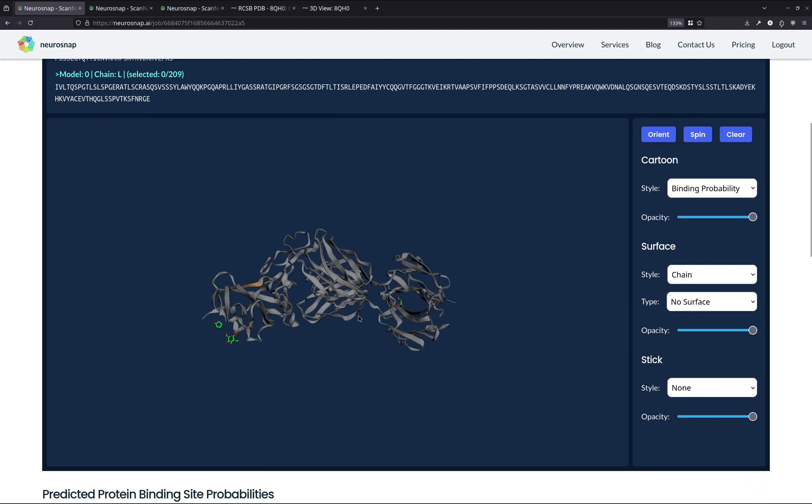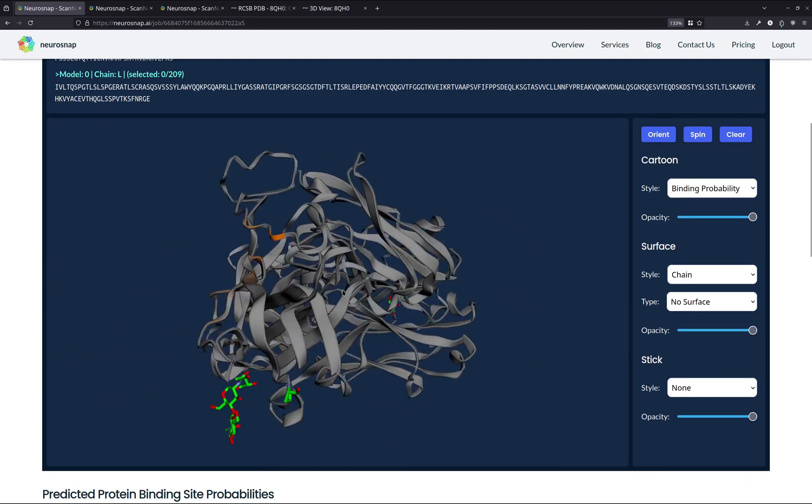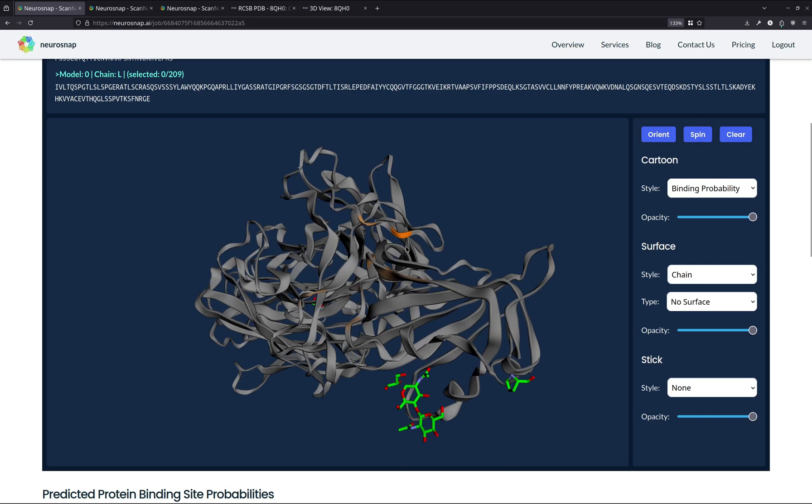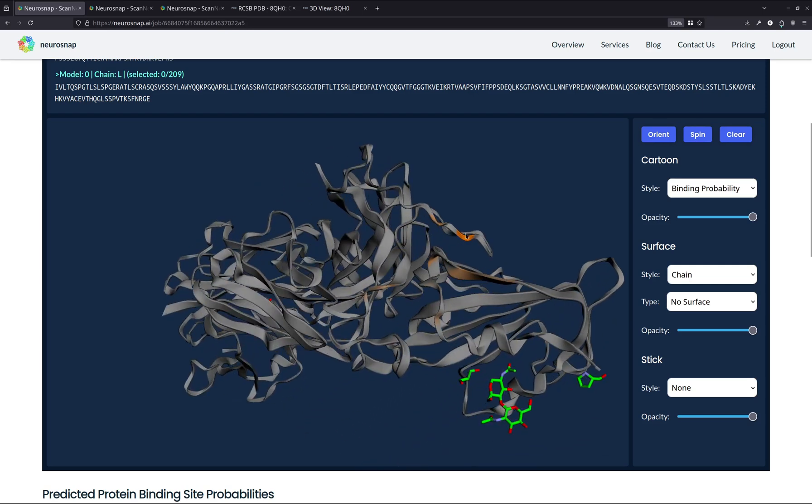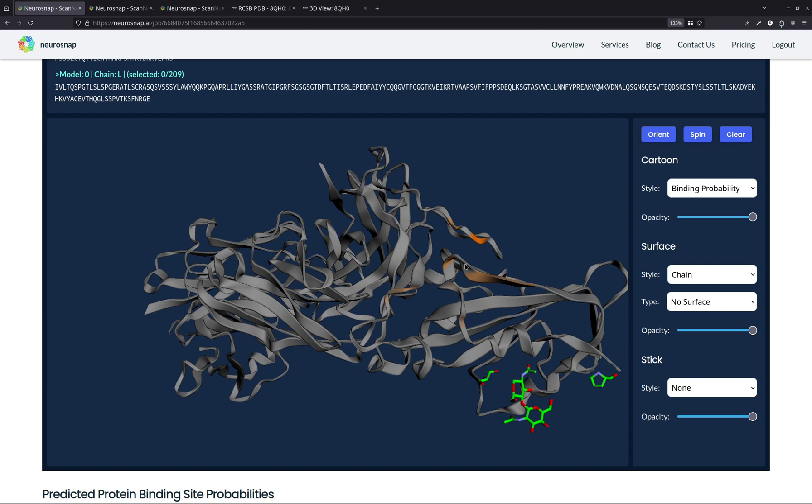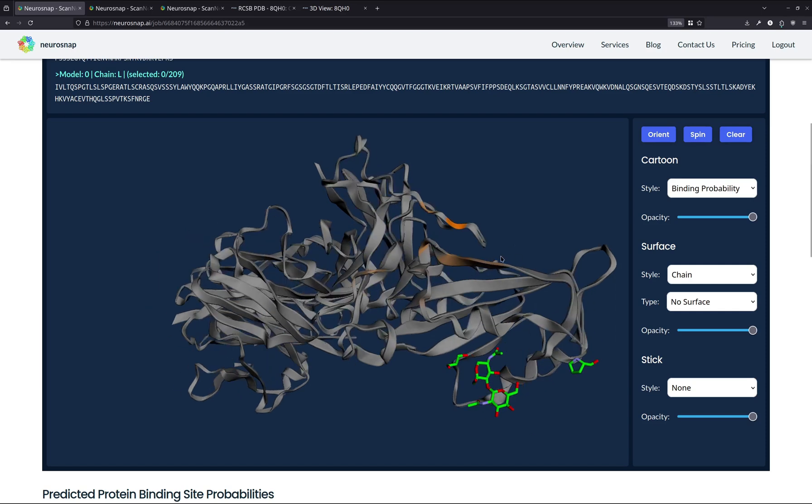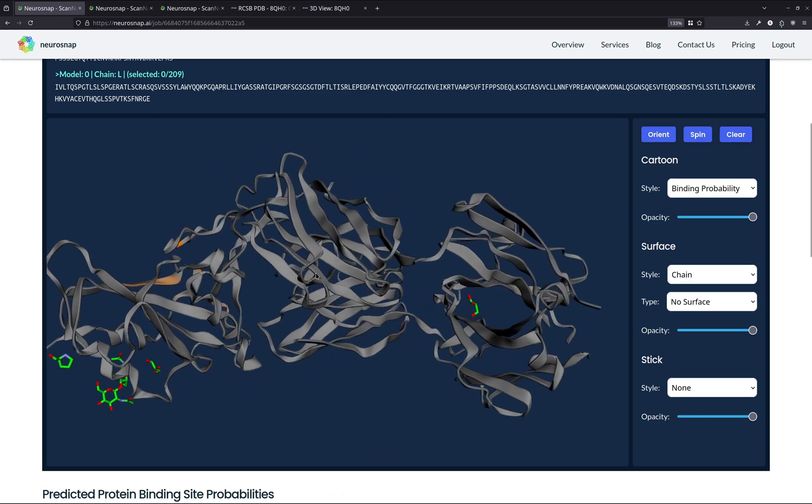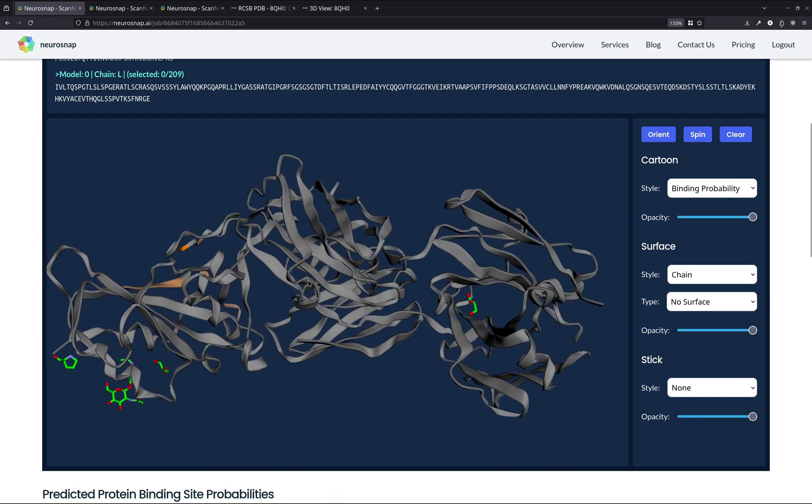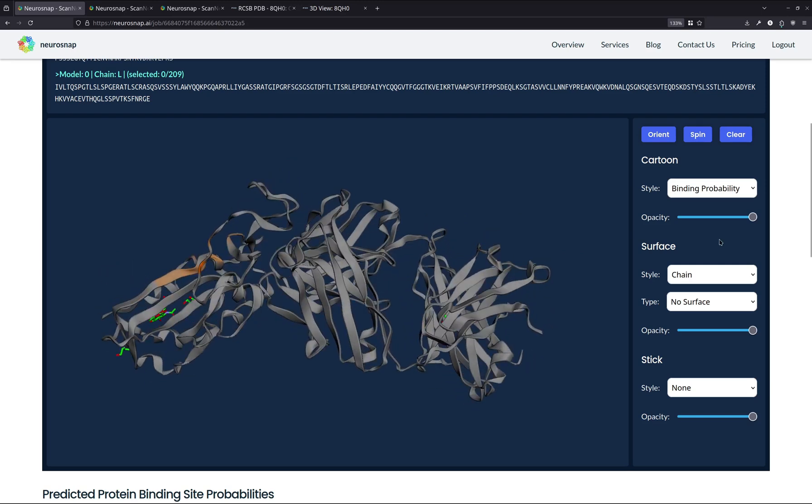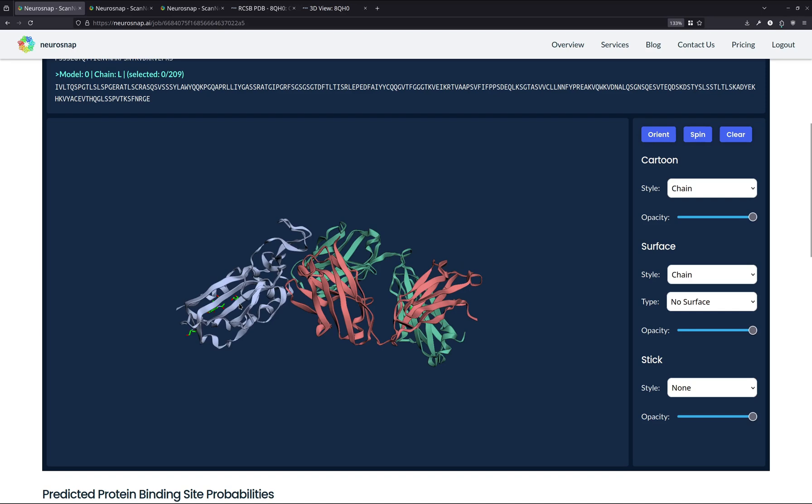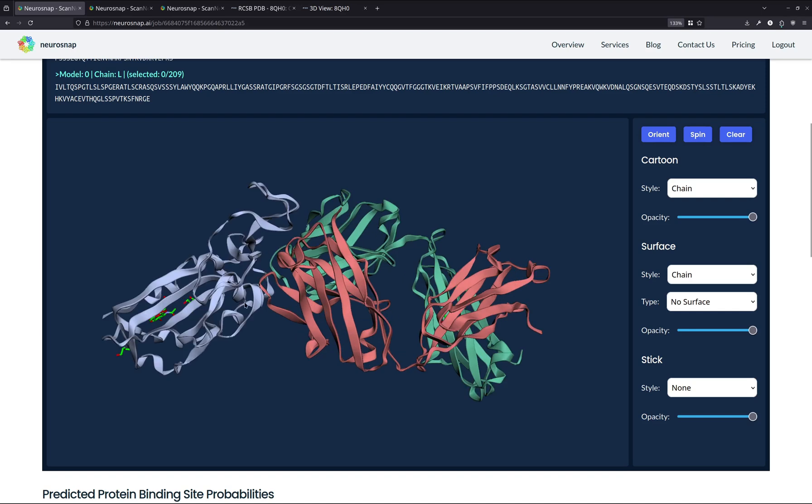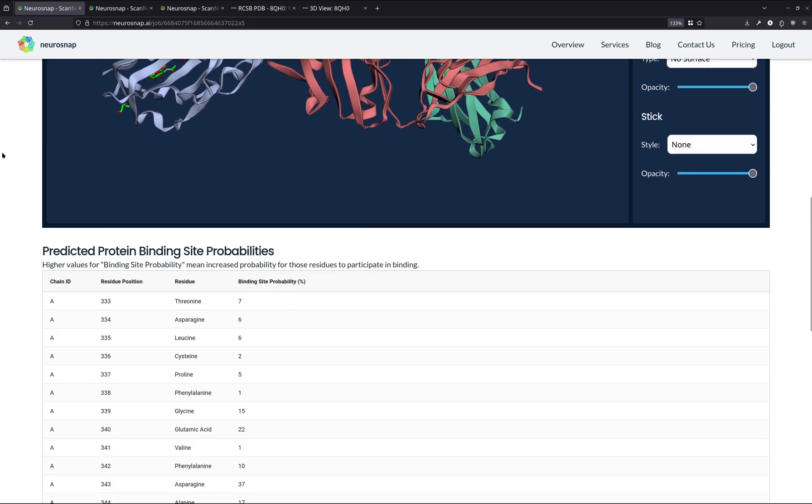As we can see, the structure is mostly gray, but there are a couple orange residues. Now what these orange residues mean is the more orange a residue is, the greater the binding site probability for those specific residues. As we can see for this structure, the binding site probabilities overall is very low and the entire structure is mostly gray. And this makes a lot of sense as we already have an entire antibody that's bound to the receptor binding domain of the spike protein. So there isn't a whole lot of real estate for more proteins, for more protein interactions to actually come about.